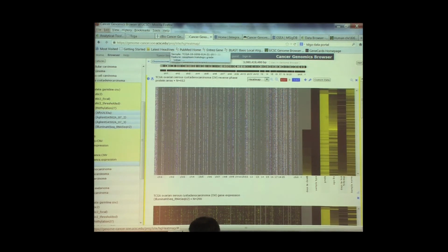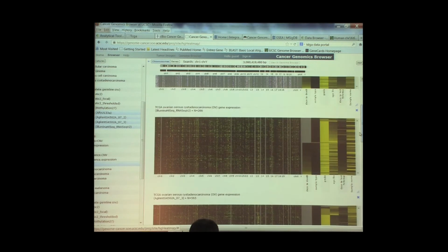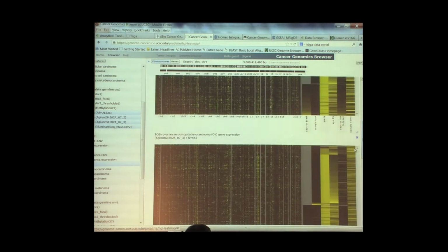This is your clinical annotation, and what normally comes up is just basic sample type, things like grade, age at diagnosis, days of follow-up, and the sample names. So if you want a subset based on sample name, you can do that. If you want to subset on days of follow-up and things. So you've got your protein data, and we have our gene expression data sets.